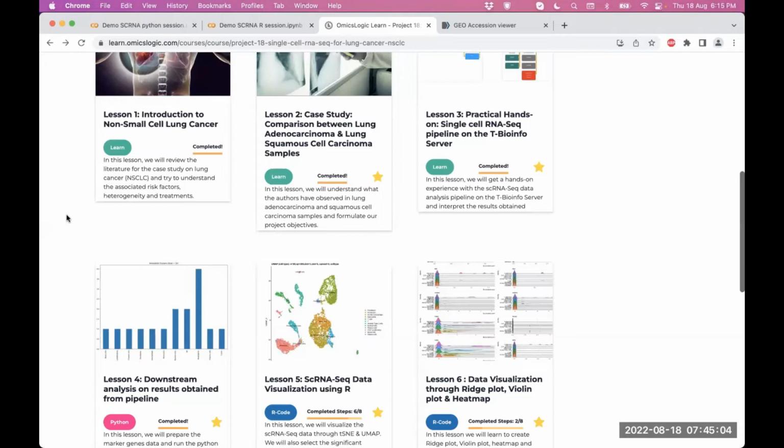There are advantages of using analysis options inside Seurat's package, and there are also several other advantages of using similar analysis methods outside of Seurat's package. So we will also explore those methods today.